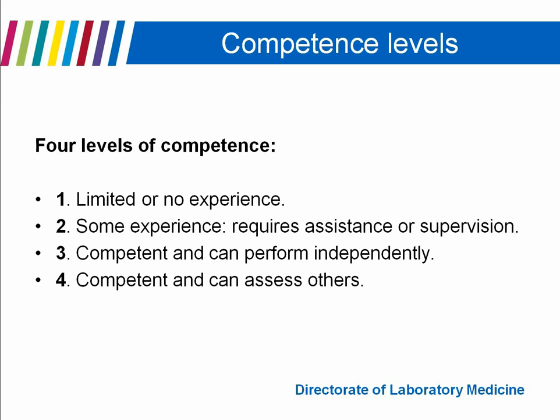You can use a simple pass-fail approach, or you can assign users, intermediate users, super users, so on. So I think as long as you can establish a criteria and justify that criteria for competency assessment, you will be okay when it comes to your ISO inspection.